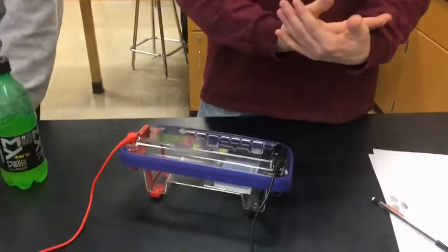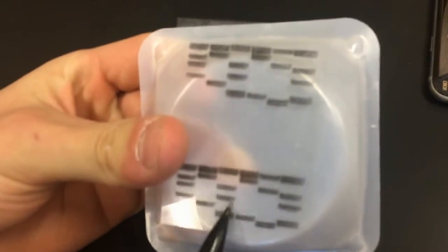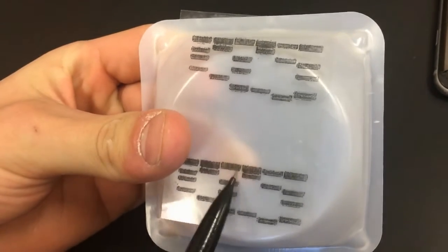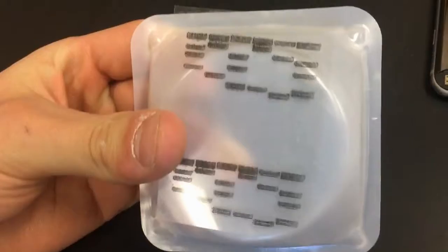Currently we don't have it plugged in to run the gel, and then you're going to run the chamber, and once that's run, you're going to get something that looks like this, where each DNA has cuts in its own way because of the way the restriction enzymes cut them, and that's how you run your gel to see how your restriction enzymes come out.